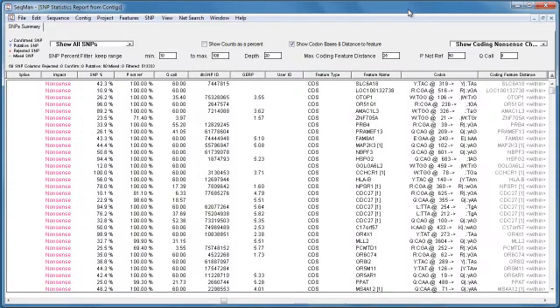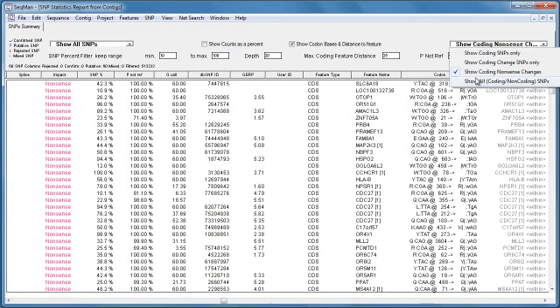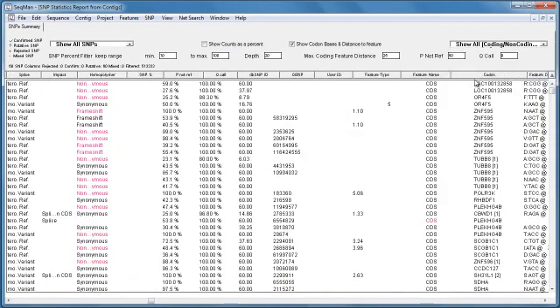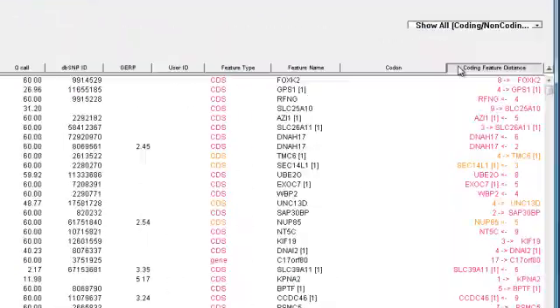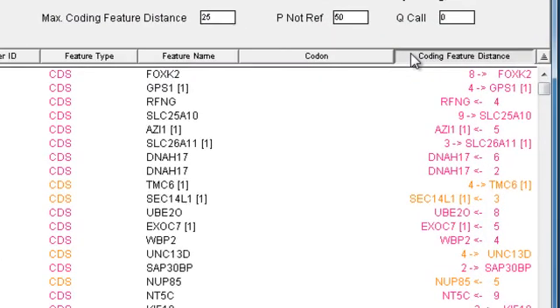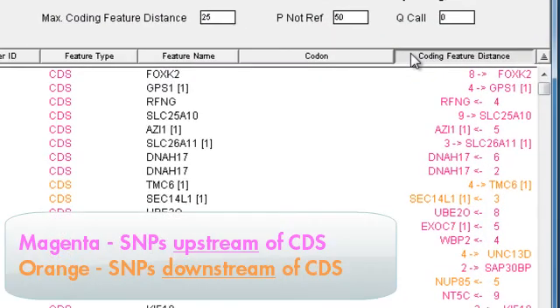I'm going to switch this filter back to showing coding and non-coding SNPs. And then sort on the coding feature distance column to see SNPs that occur upstream or downstream of a coding sequence shown in magenta and orange.